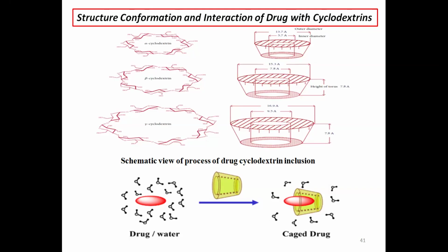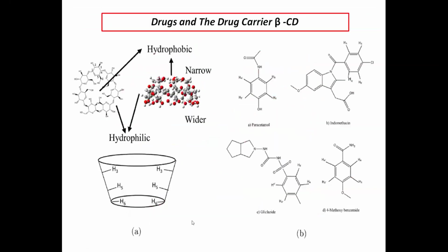And when this happens, there is a change in the NMR parameters. So we measured the relaxation time, and we also generated the long-lived states, and we compared them, and we then confirmed how much drug can be put inside the drug carrier when the drug goes inside. That can be measured by using the NMR method, which we did. So here is the structure, just to show you. There are 4 different drugs we tested, and this is the cavity of the beta cyclodextrin, inside and outside.